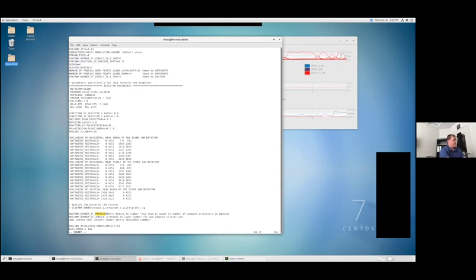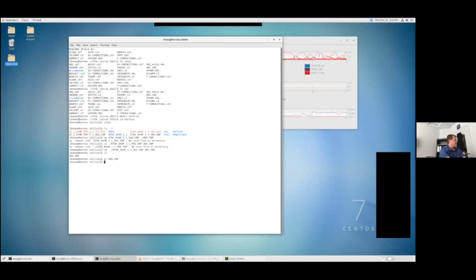So I would go ahead in here, make the changes to the input file that I needed to do, and then I would come back to the command line and type the command XDS_par, hit execute, and that would run XDS. Okay.